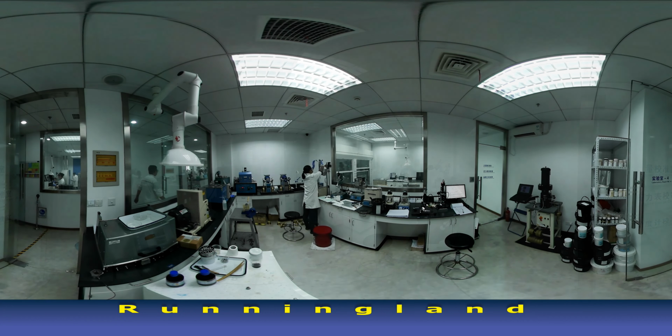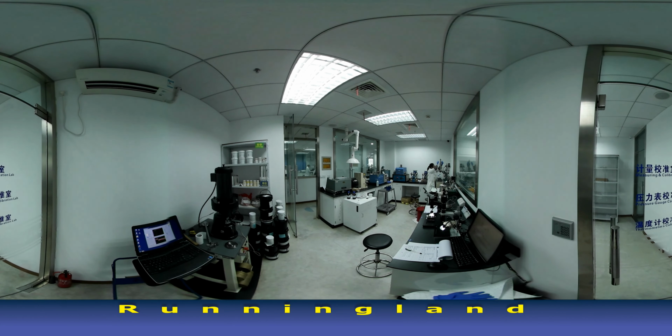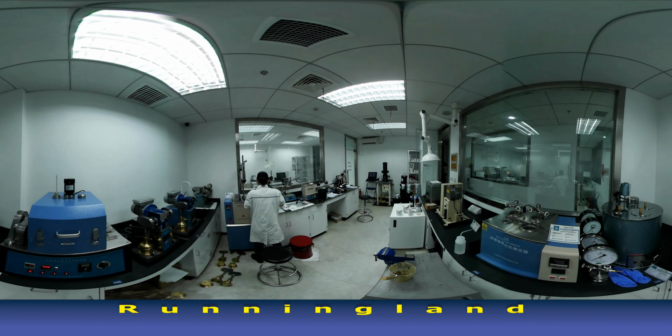Now, the 4-ball wear tester method is used to determine relative wear preventative properties and load-bearing capacity of lubricating fluids in sliding contact. The test methods are ASTM D2266 and ASTM D4172. However, in this case, our staff usually perform ASTM D2266, which is used for lubricating grease.